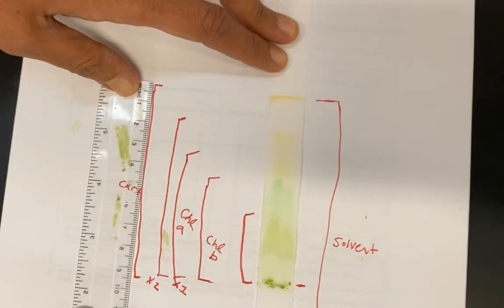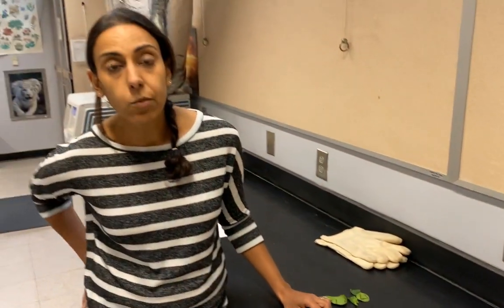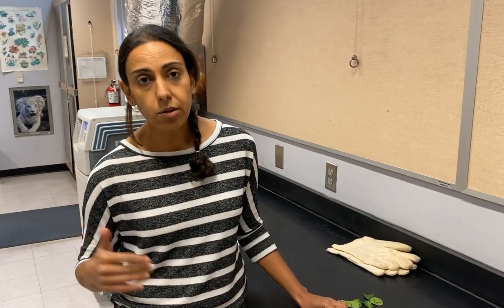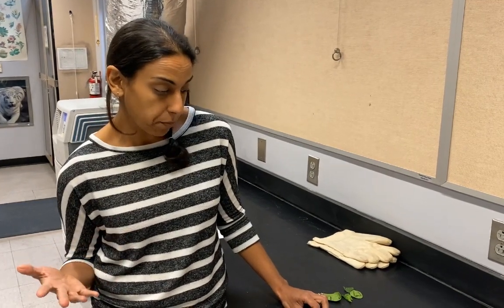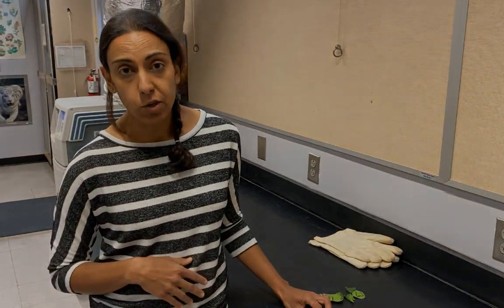So those measurements all go in your lab report. And then what you're going to do is try to get the RF values by dividing everything by the solvent. So when you do that, you're going to get all numbers under one. So your carotene might be closer to like a 0.8 or 0.9, where your chlorophyll B is probably going to be a much smaller number, a little bit closer to zero, not zero, but closer to zero. And you'll get a range by doing those measurements.